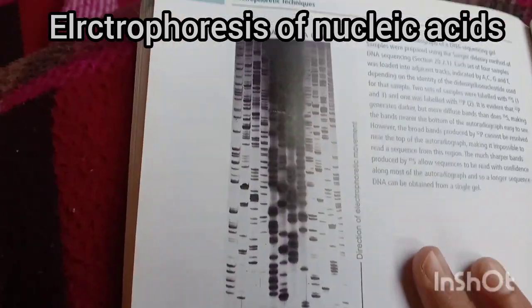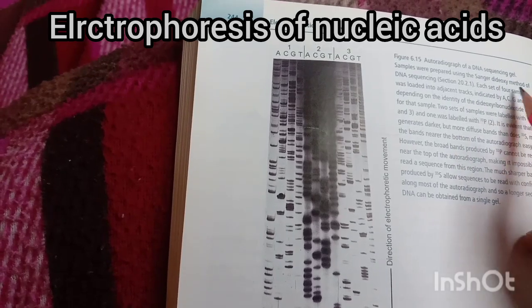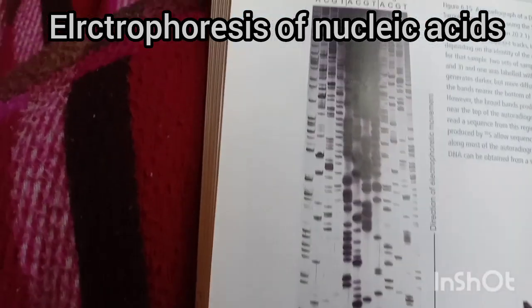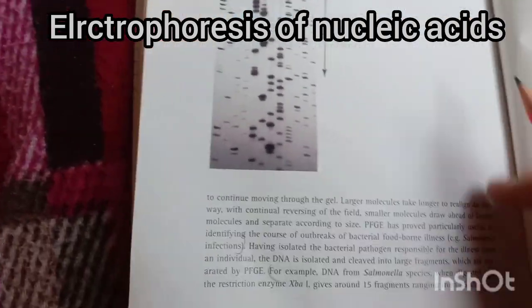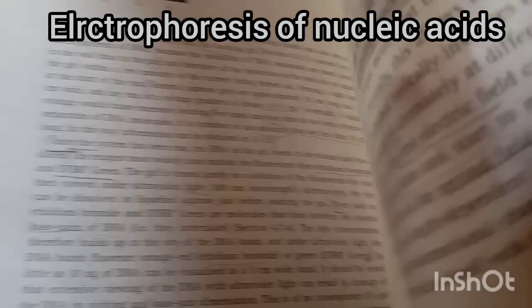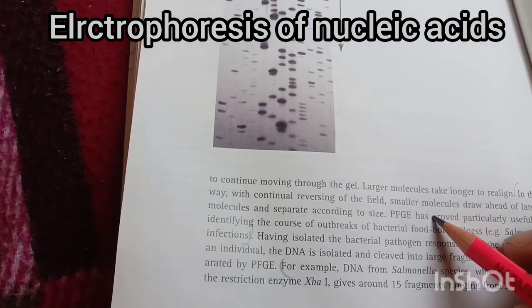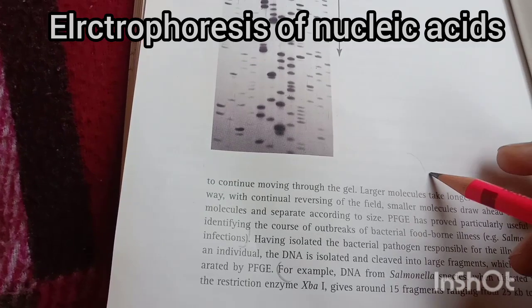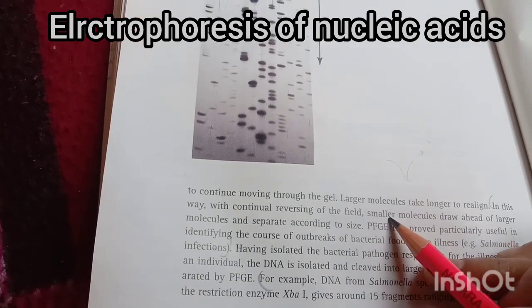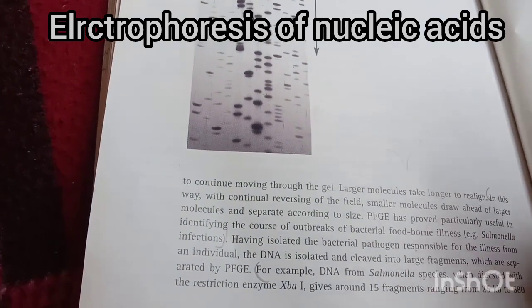So this is the autoradiograph of sequencing gel samples prepared using the Sanger dideoxy method of DNA sequencing. This is a DNA sequencing method. So we studied here two electric fields. In this way, with continual reversing of the field, one is moving in this direction, the second electric field is moving in another direction. So the smaller molecules and larger molecules separate according to size.